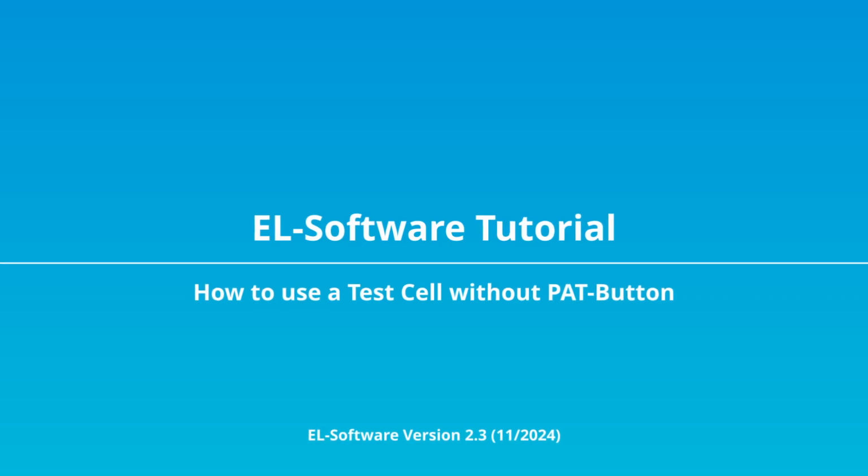Welcome to our EL software tutorial series. Today, I will show you how to use a test cell that is not equipped with a PAT button.